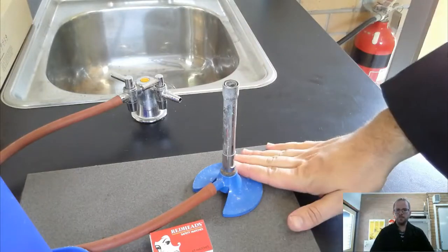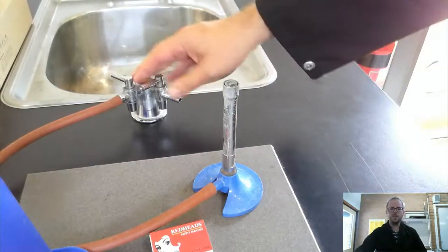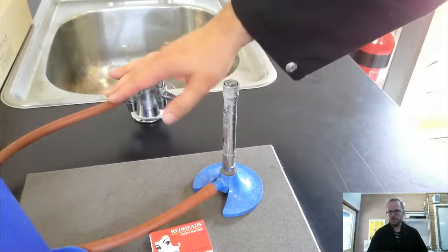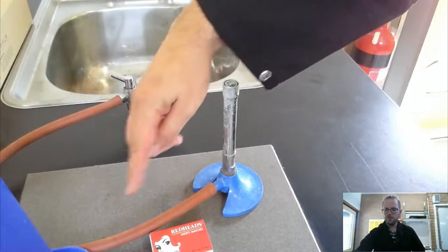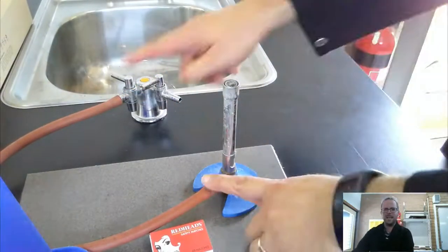So here we have the Bunsen burner. On the benches that we use, we have gas taps which our Bunsen burner will connect to. You can see that it's got here a rubber hose that connects from the Bunsen burner here all the way to the gas tap over here.